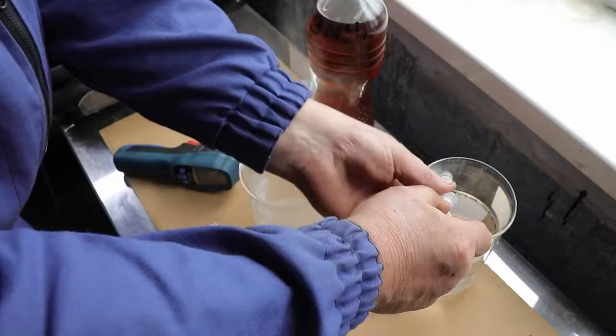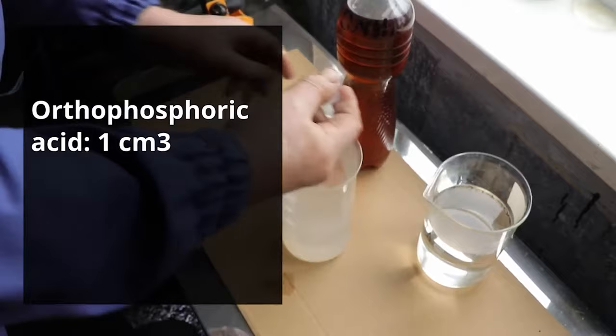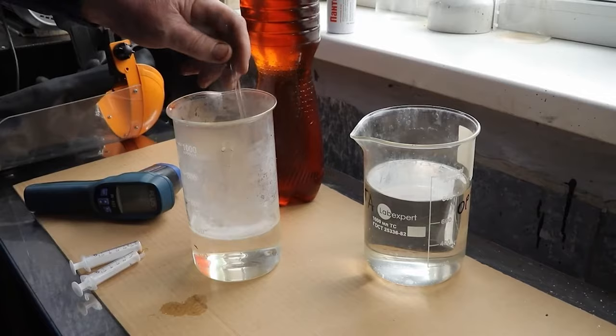After that, we take 1 cubic centimeter of orthophosphoric acid, add it to the mixture of water and emulsifier, and mix it all again.